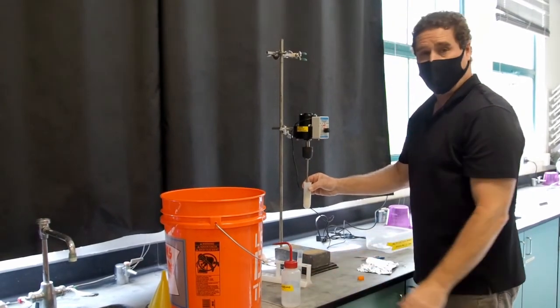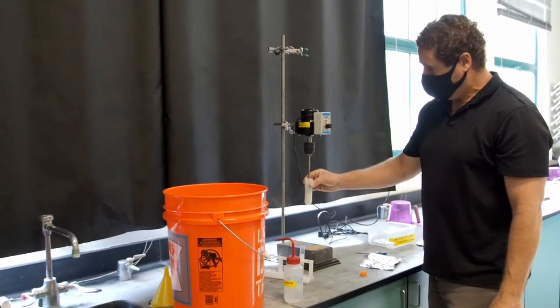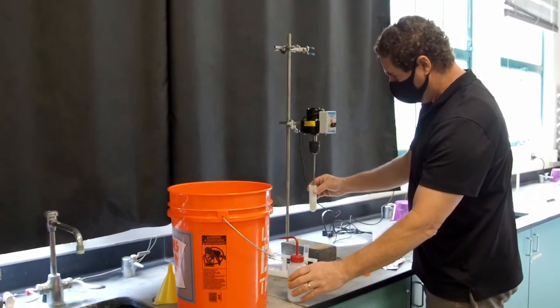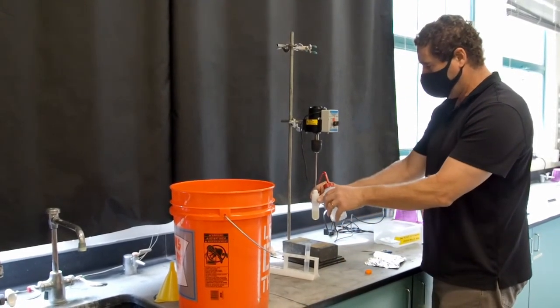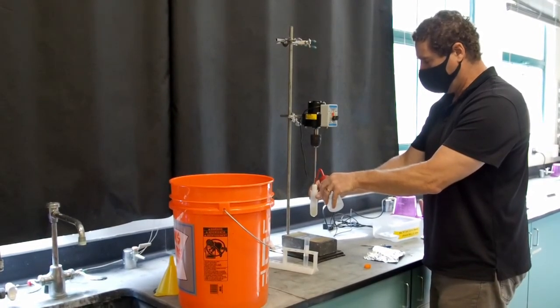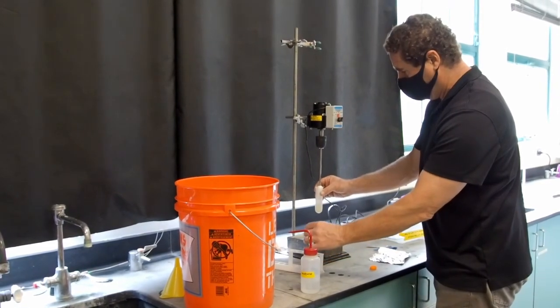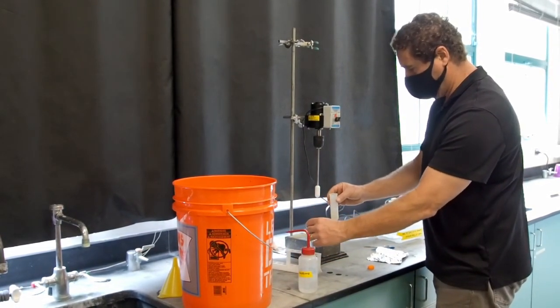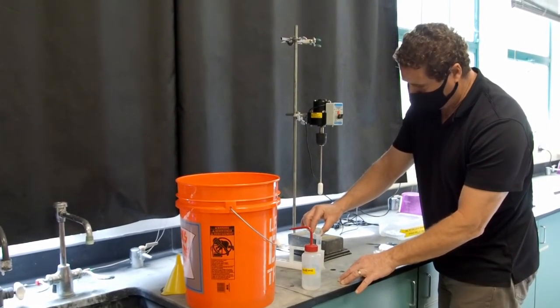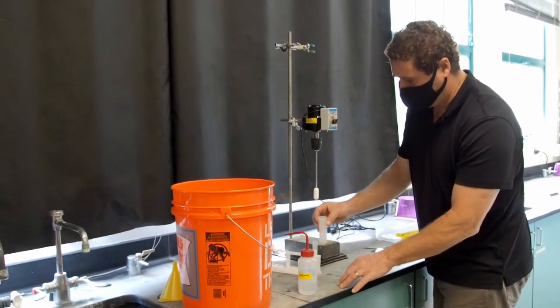All right, so we've been grinding this sample now for a few minutes. It's pretty well pulverized. And what I'm going to do is stop the grinder. I'm going to pull this out, use a little bit of acetone to carefully get any little bits that might be on the grinder down into the tube. And then we're going to decant this into a centrifuge tube. So we're just going to pour off everything that's in here, the liquid and the little bits that are solid that are still left, into the centrifuge tube.